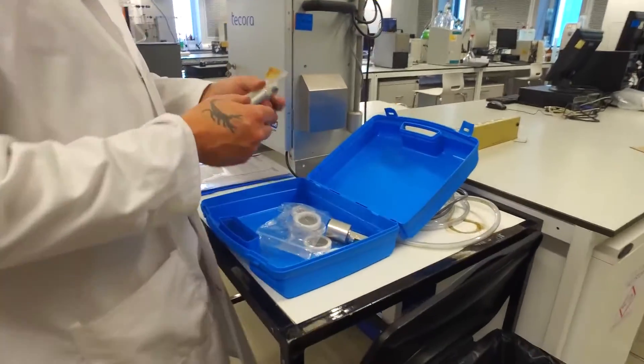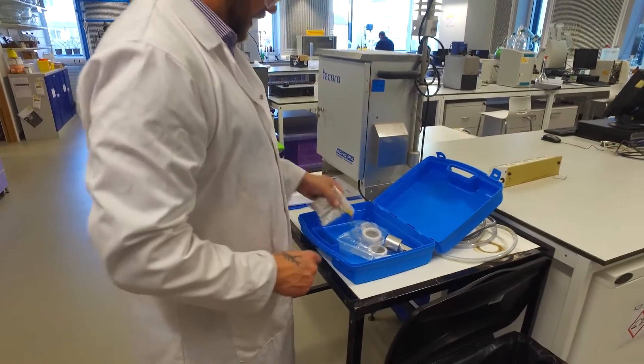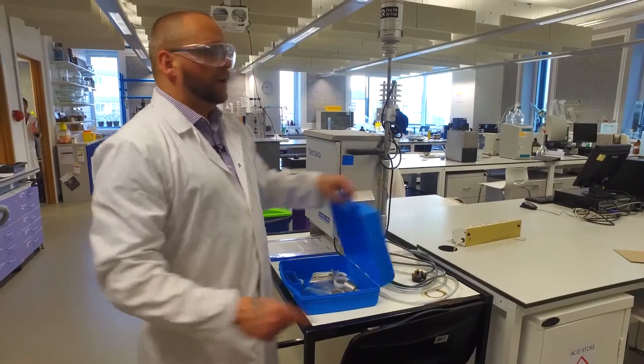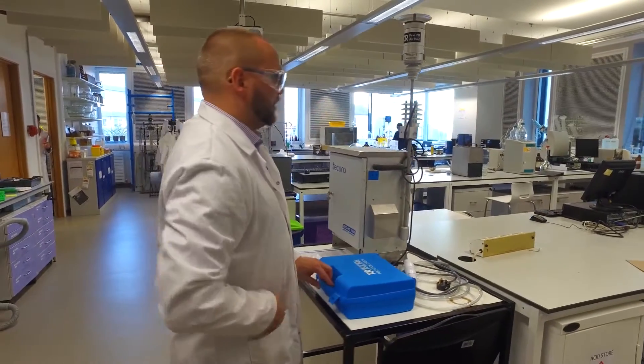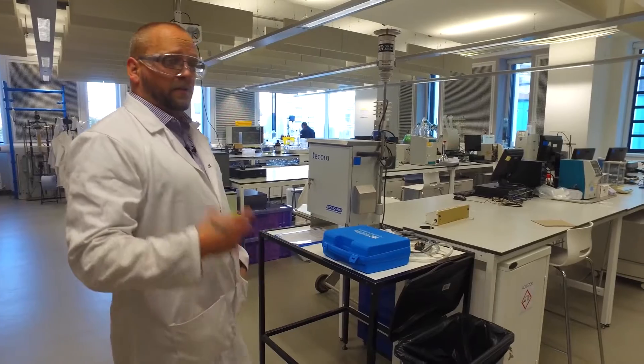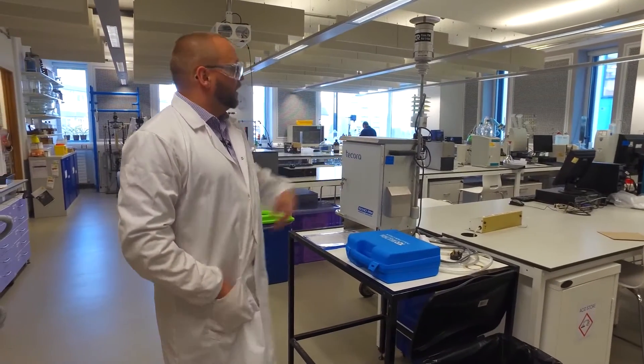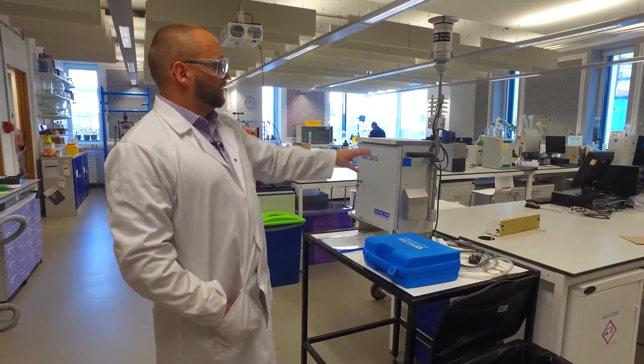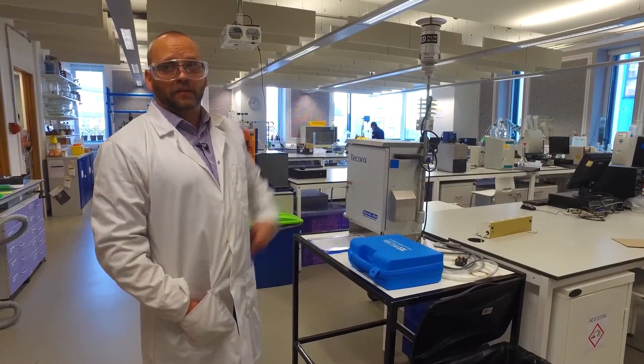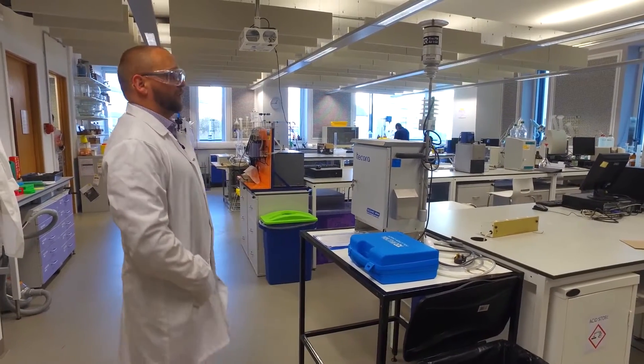It looks like this piece of kit here which will have an absorbent inside. You can then elute this and run it through GC analysis or ion chromatography and determine what's been absorbed. You can directly ascertain the environmental impact, even probably take that out onto Sheffield streets and look at the air pollution.